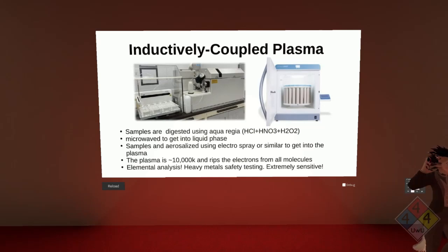We're talking, I believe they're down to femtograms. It's a very small amount, and so they're using the power of the sun to make sure your pot is safe. And this is definitely probably one of the bigger hazards in the lab because of the caustic solvents that are used. But it's also honestly one of the cooler instruments to talk about. Just wear your safety glasses, y'all.